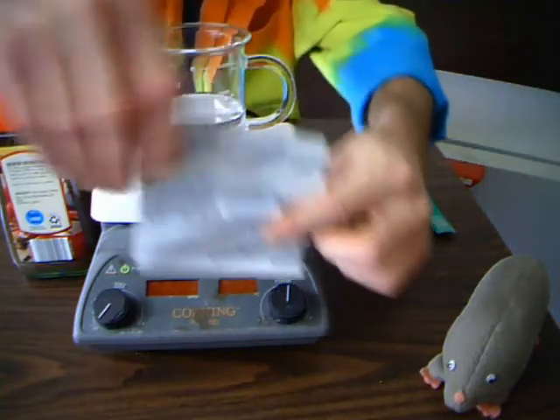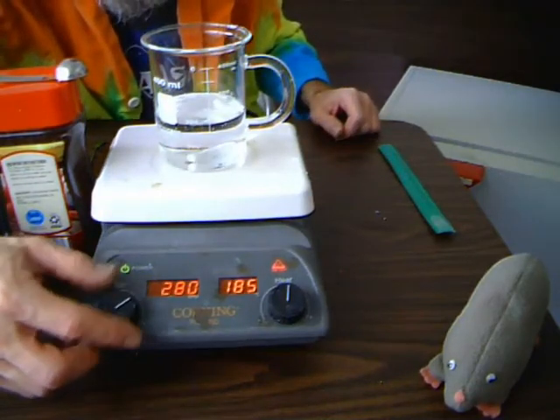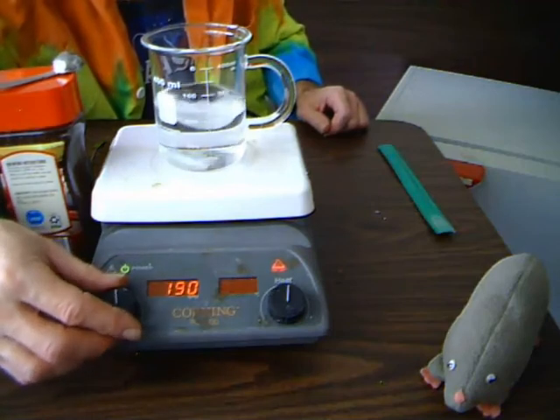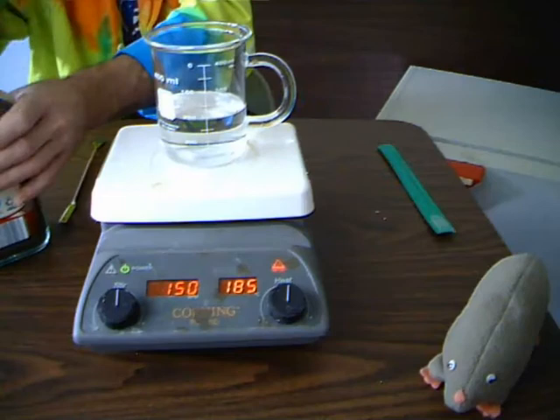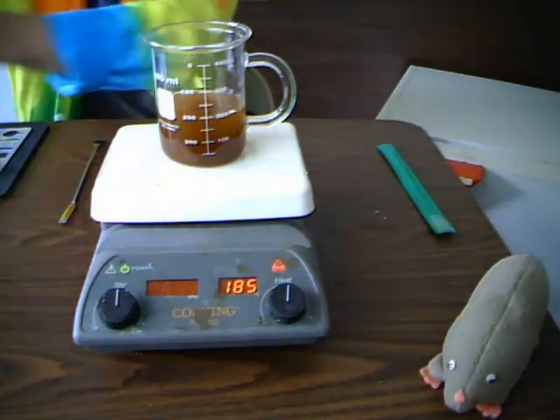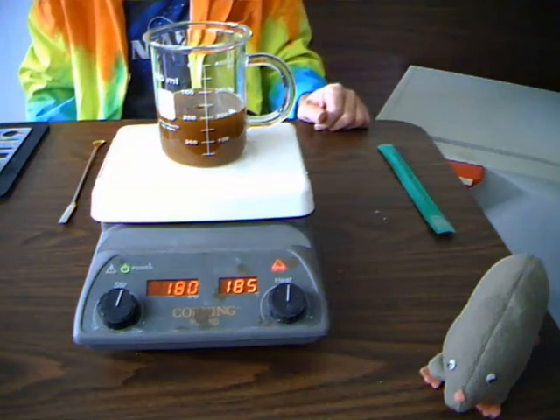Sometimes if you get it stirring too fast it jumps around, so then you just want to slow it down. I'll add one rounded teaspoon of coffee into my beaker. If I turn it up just a little bit, in just a couple of minutes my coffee will be ready.